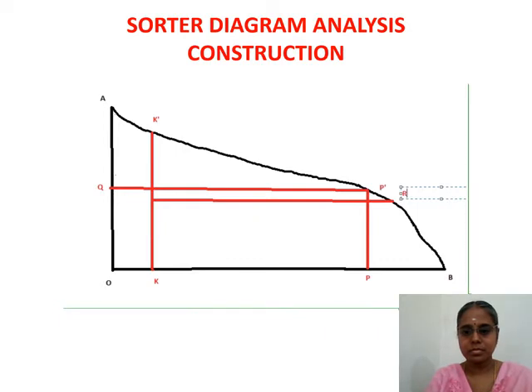And the R dash, just R dash. Anything on the curve is with dash. The same notation with and complementary dash. So from R dash, draw a perpendicular to OB which touches the curve or line OB at R. So mark R.